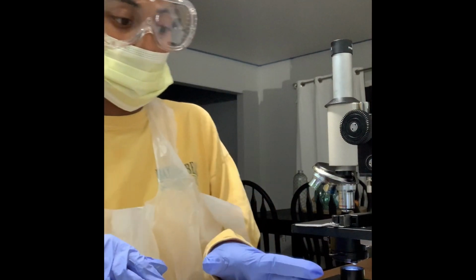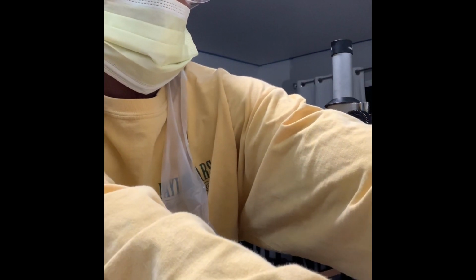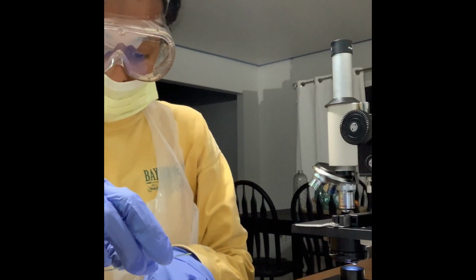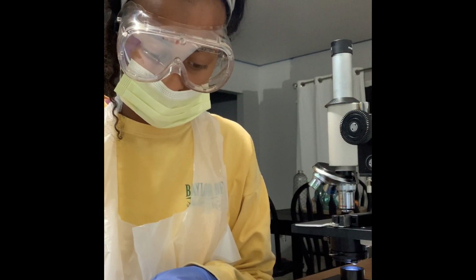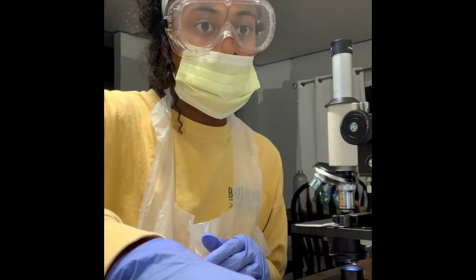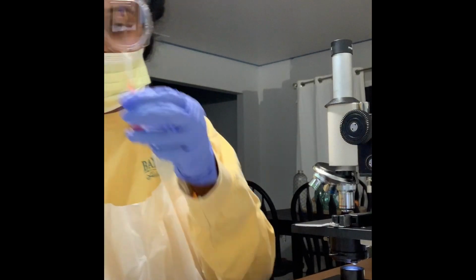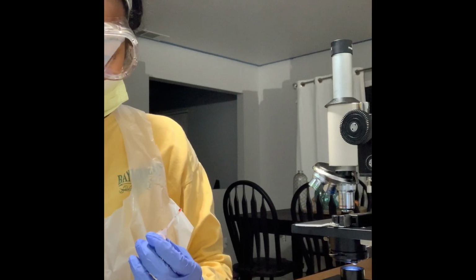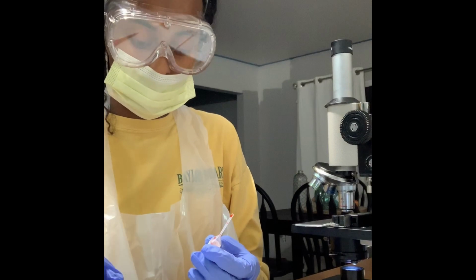While that's cooling, I am going to move on to the second part of step 1, which is "2 negative M," and that means it's the second slide and it's using the negative stain for my mouth as well. So now I am going to pour the Congo red, the negative stain, over a trash bag, and put a drop of this on my slide.